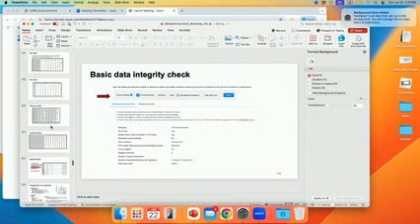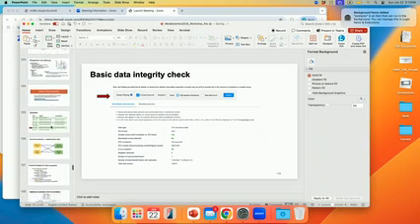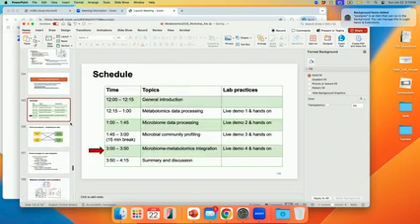In terms of microbiome, a lot of what we have done, like MaAsLin 2, follows what they have done. So reproducibility is a baseline for what we are doing. We follow what they have done and also adapt to the latest results, so most of the time our result is better.